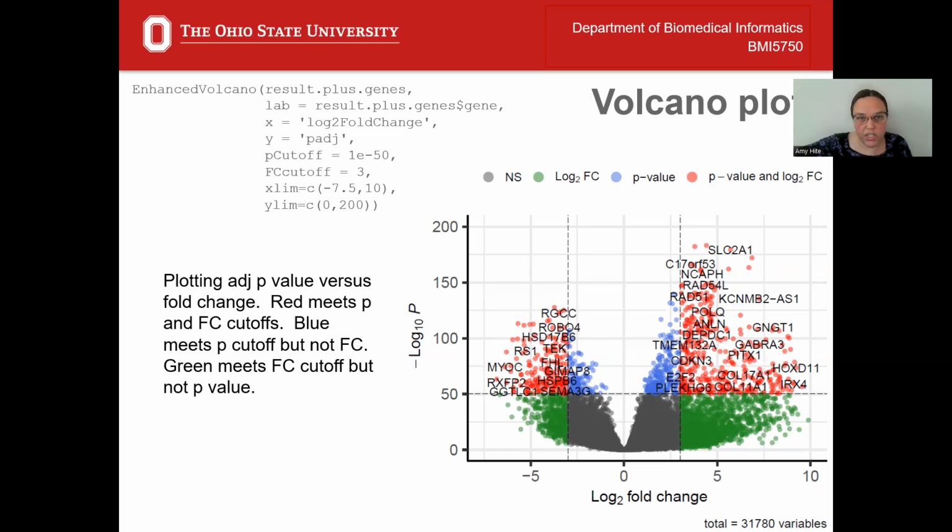And the direction of positive and negative is determined by your grouping information. So you should set your group as a factor, and you should set the levels of your factors. So you have control over which group is positive and which group is represented by the negative.